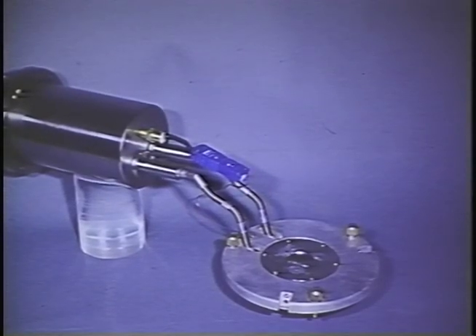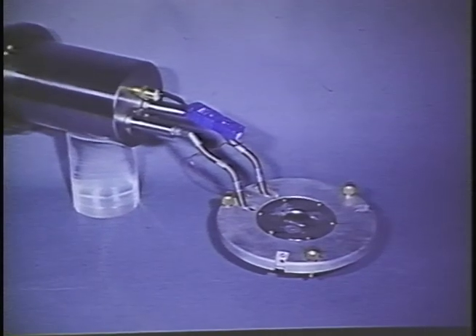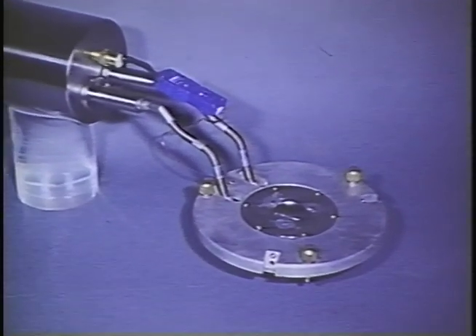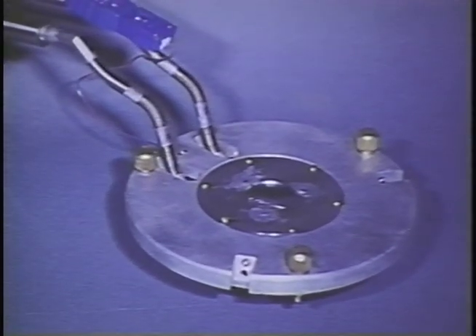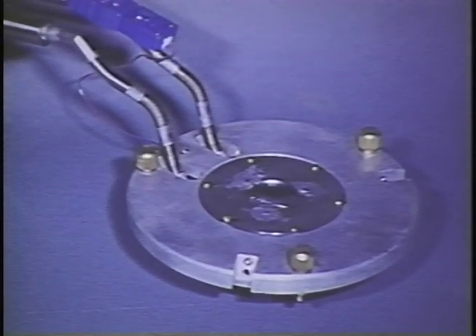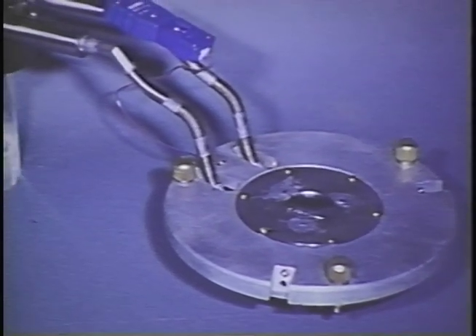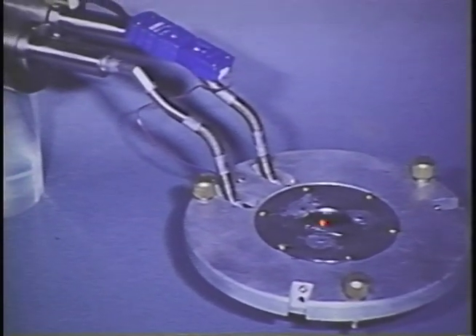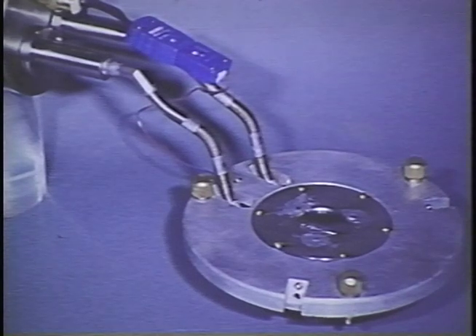This slide illustrates the cold stage that was used in the studies that I'll describe. This cold stage was designed and built by Mr. George Ray, who recently retired from our lab. This is a top entry stage, which has a point-to-point resolution of greater than 8 angstrom. The specimen, which sits in the center of the stage, is cooled by nitrogen gas, and we routinely observed our frozen samples at minus 150 degrees centigrade.